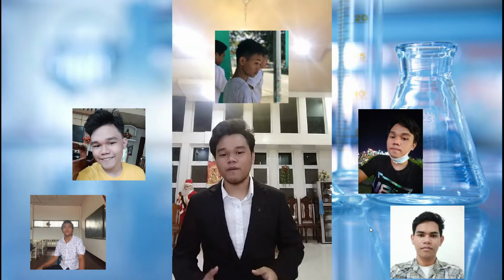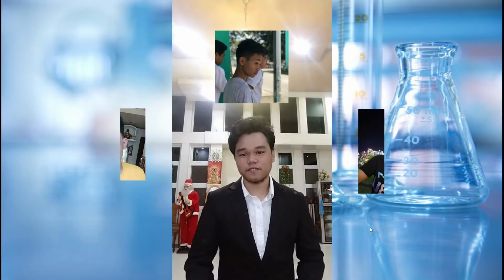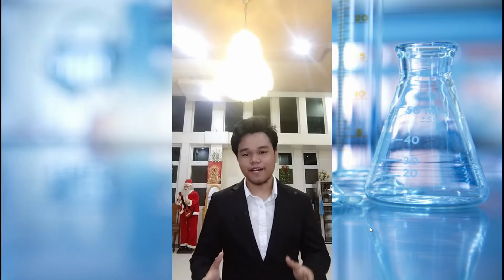Are you having trouble understanding common laboratory apparatus? Well, these students right here will teach you about the common laboratory apparatus and their functions. So let's not make this introduction much longer. Sit down, relax, and enjoy this video.